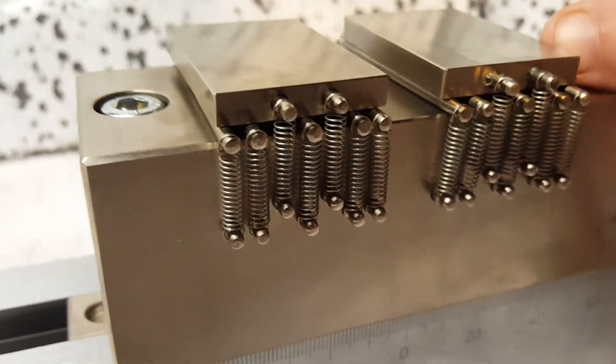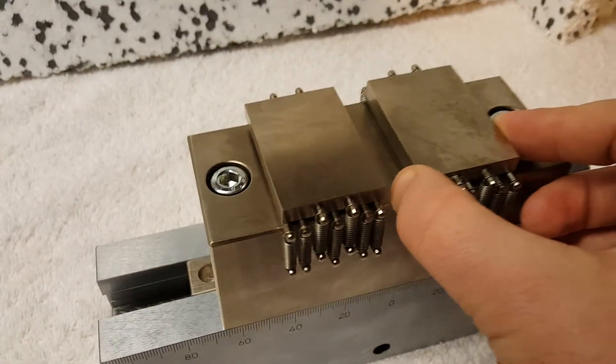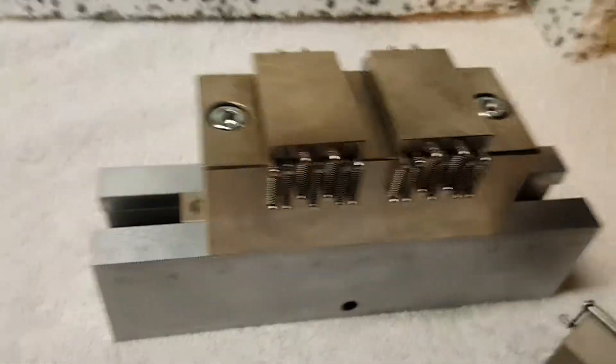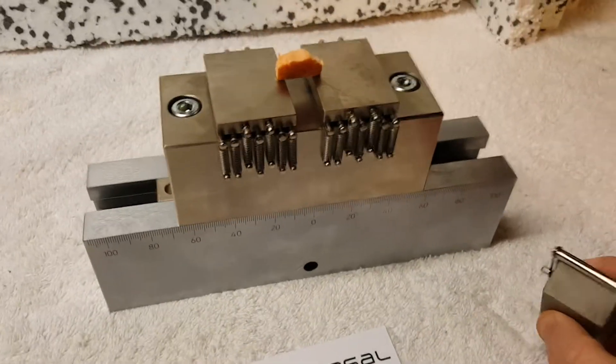The rollers are restricted by springs, so they slide back and forth to ease the local strain on the curved sample. The sample would look something like this — you just place it on top.